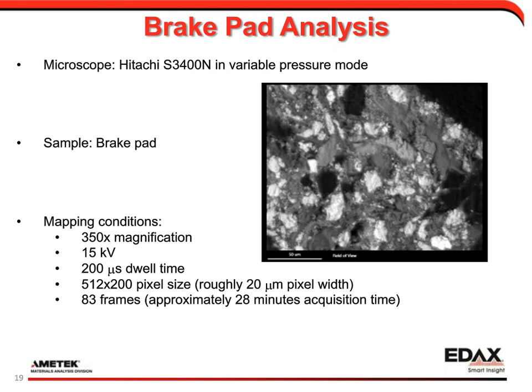There's a question about how low can we go again, but this time not in extraction voltage, in concentration. Whether we can detect compounds with about 1 atomic percent. And that is a tricky question to answer because it heavily depends on what element we're talking about. If we're talking about heavy elements, where we get good line separation and good X-ray counts, then the answer is yes. 1 atomic percent can quite easily give us a good EDS spectrum.